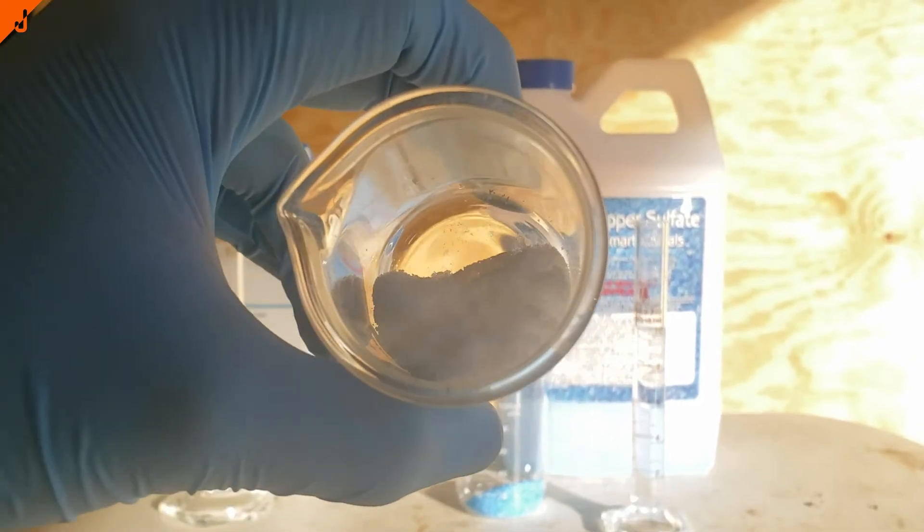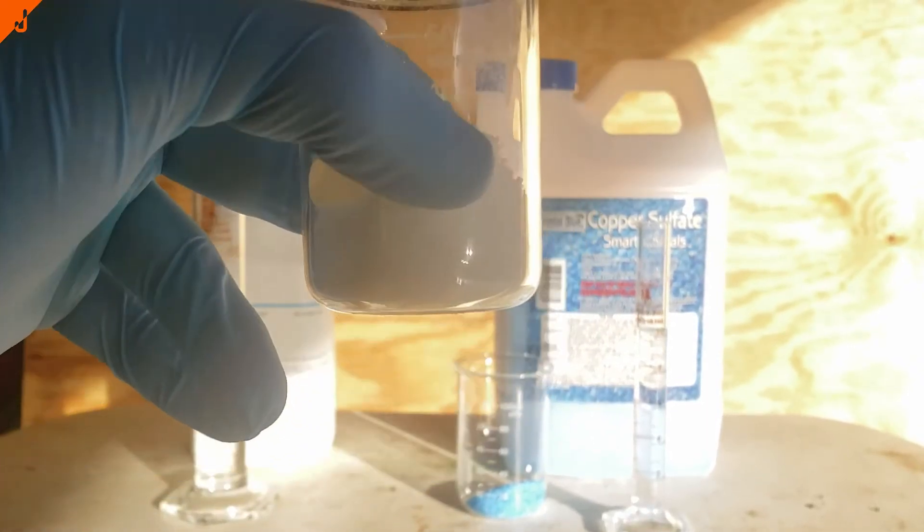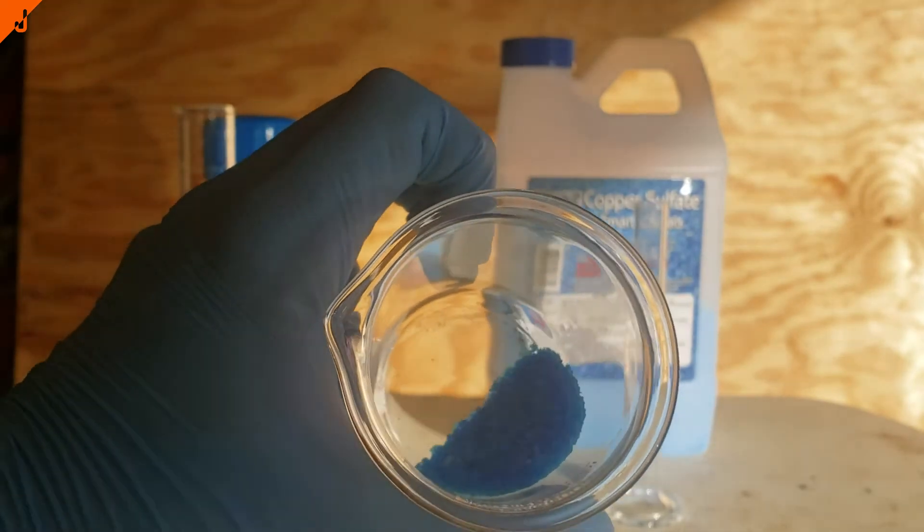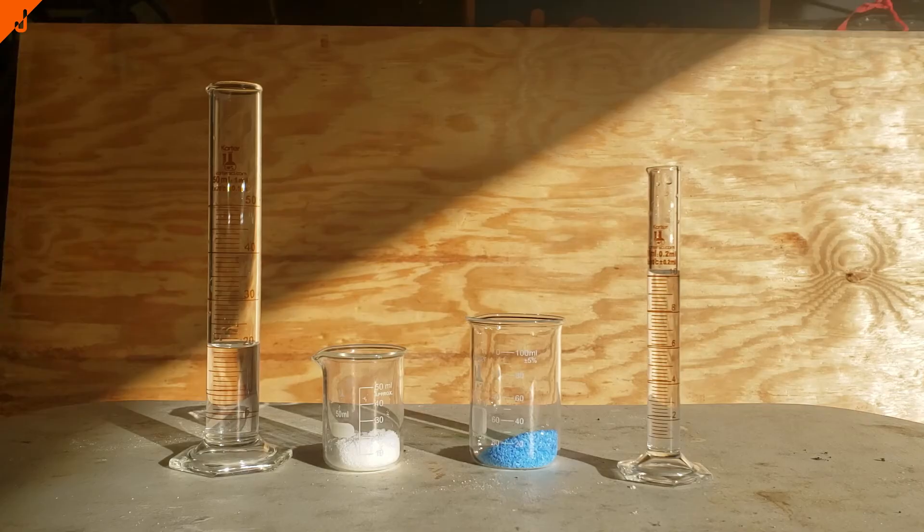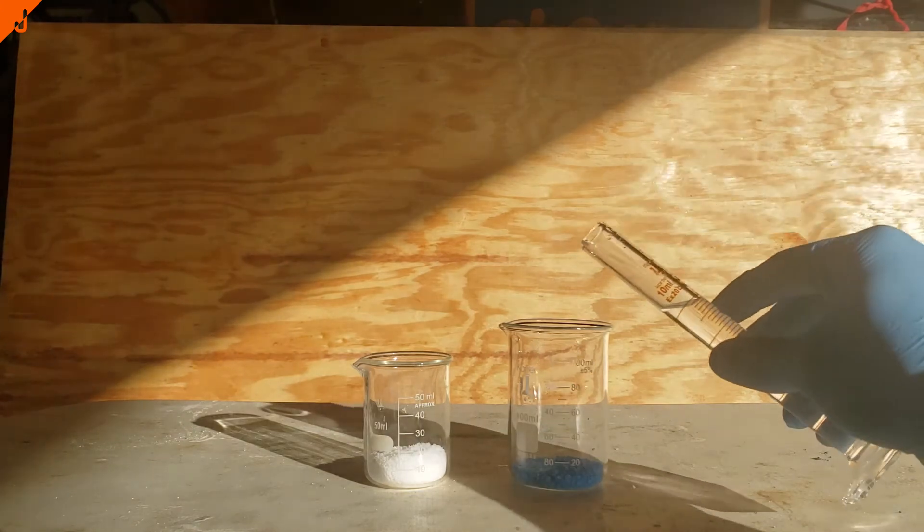First, I measured out 10 grams of potassium bromide and 6.7 grams of copper-2-sulfate. I then added water to each beaker.